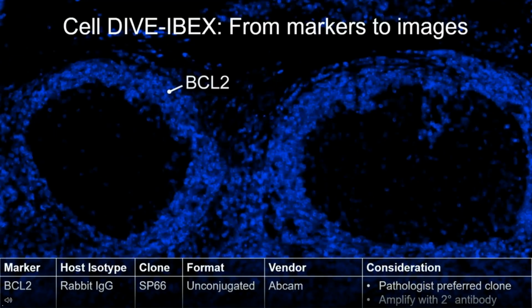And so here's just giving you a walkthrough. We talk a lot about building the markers and how do we get the images and why do we need, this is probably what many of you are interested in, and why is open the best way to go?